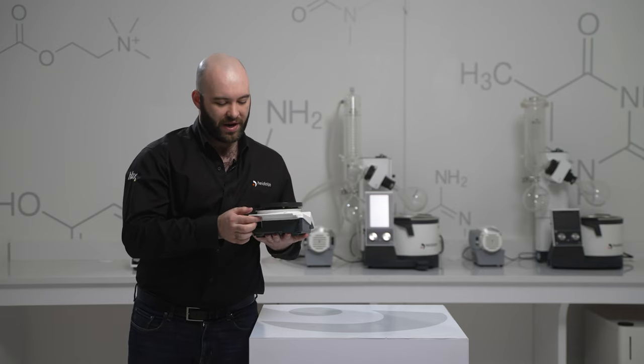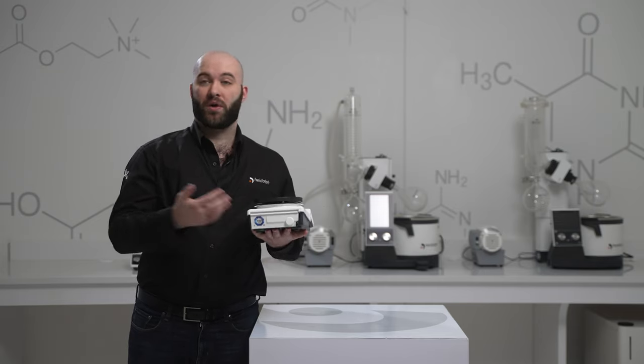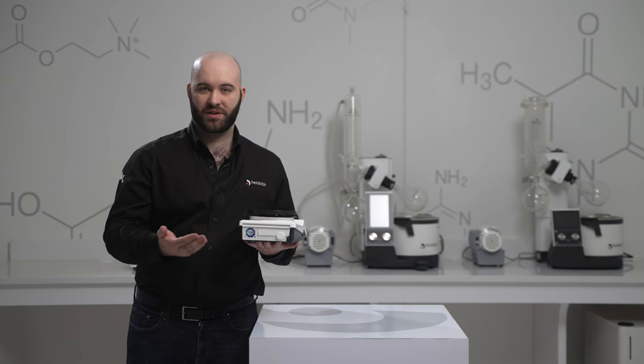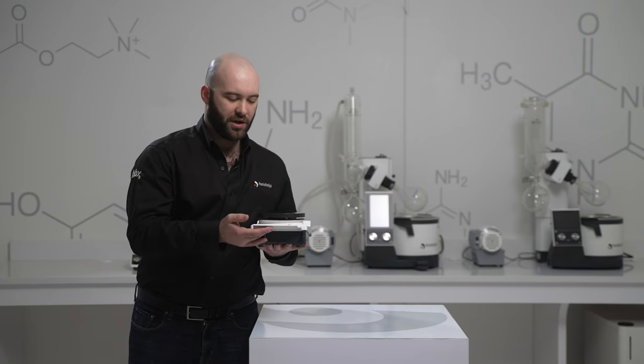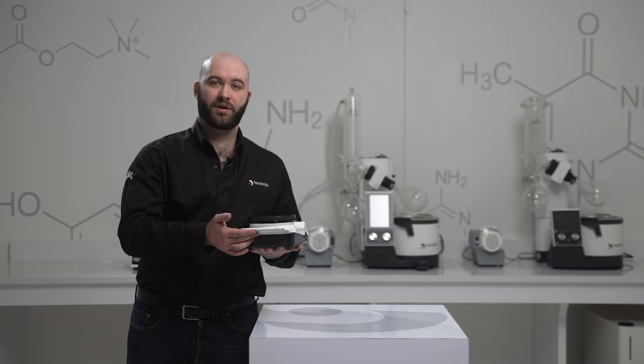On the back of the hotplate we have this protective flap so that while not in use it'll protect from dust getting inside your connectors, and while in use it'll provide additional protection from above to all of your different cables.